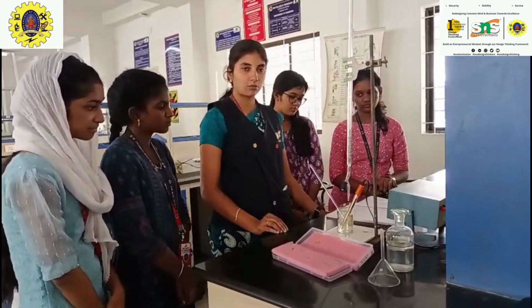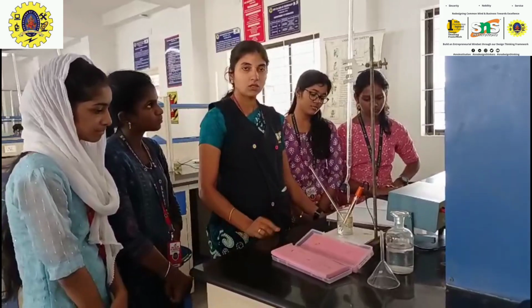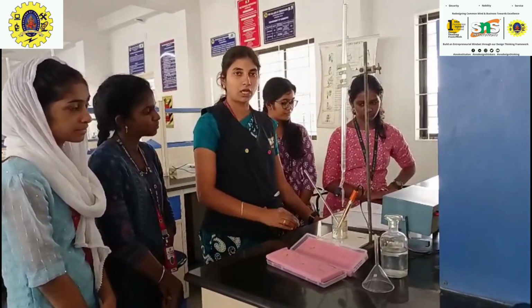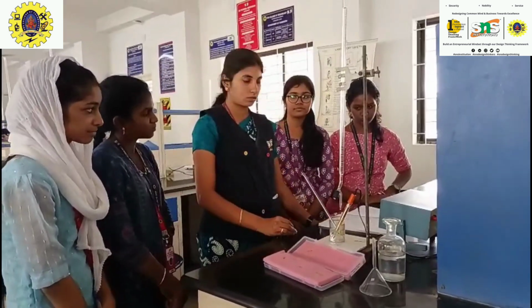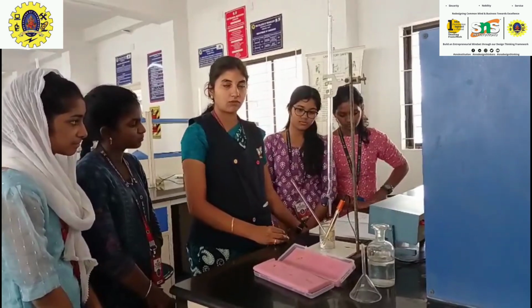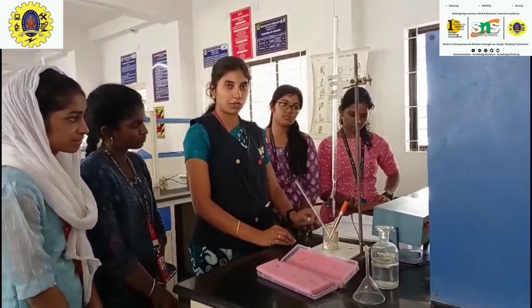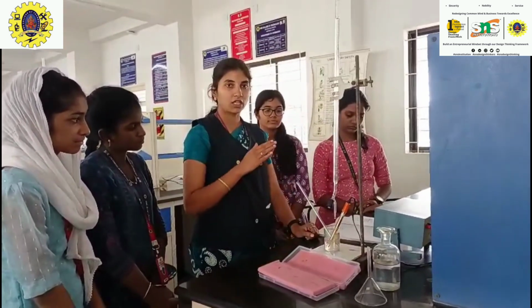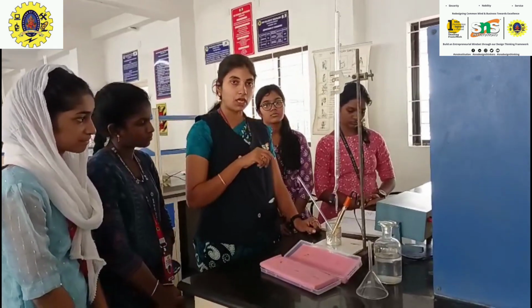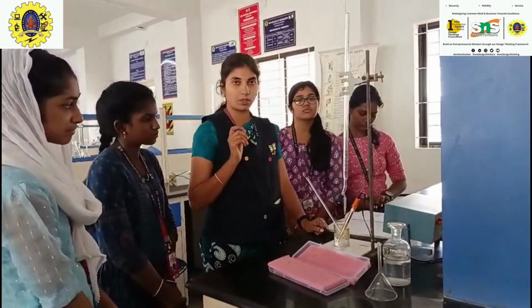The volume of sodium hydroxide runs from 0 to 10 ml in 1 ml readings: 0, 1, 2, 3, 4, 5, 6, 7, 8, 9, 10 ml, and we adjust the conductance scale accordingly. We plot the graph from point A, the reading at 0 ml, and the 1 ml reading, and join the points, which gives the B point.